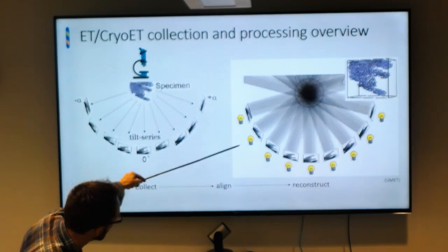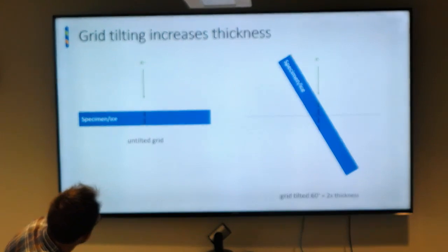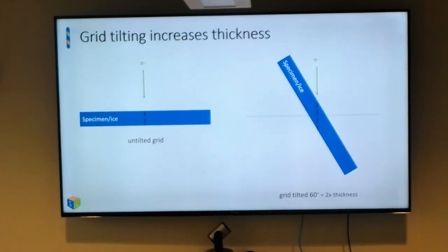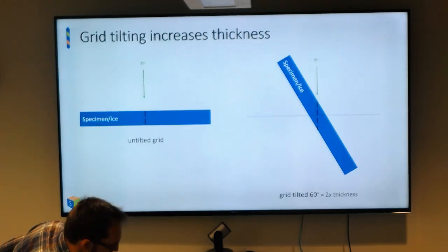The goal is to get a good quality realignment. All right? Okay. And I'll go over why you might not want to use these gold beads. I'll ask you why in a minute.